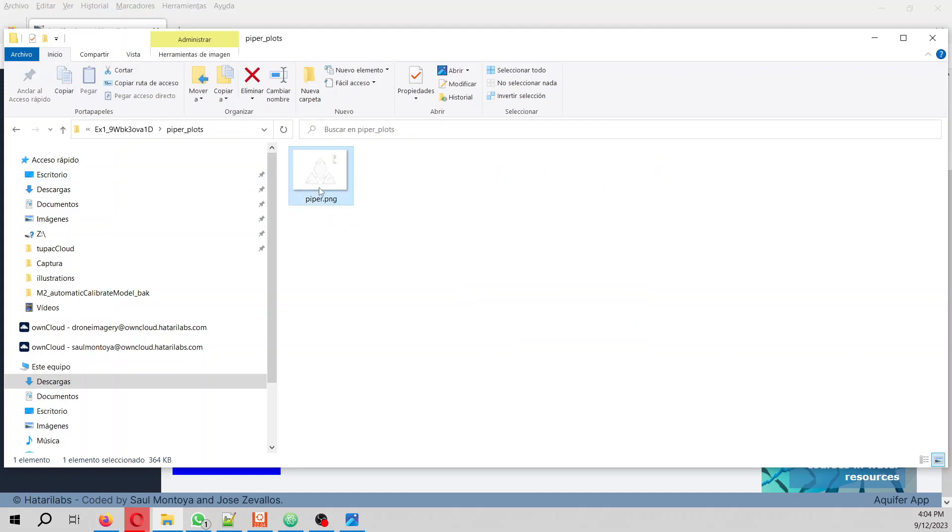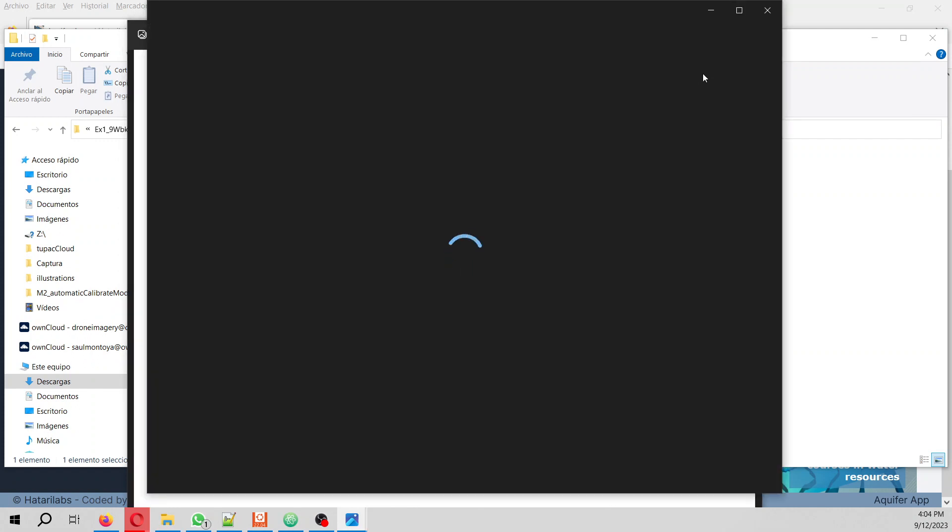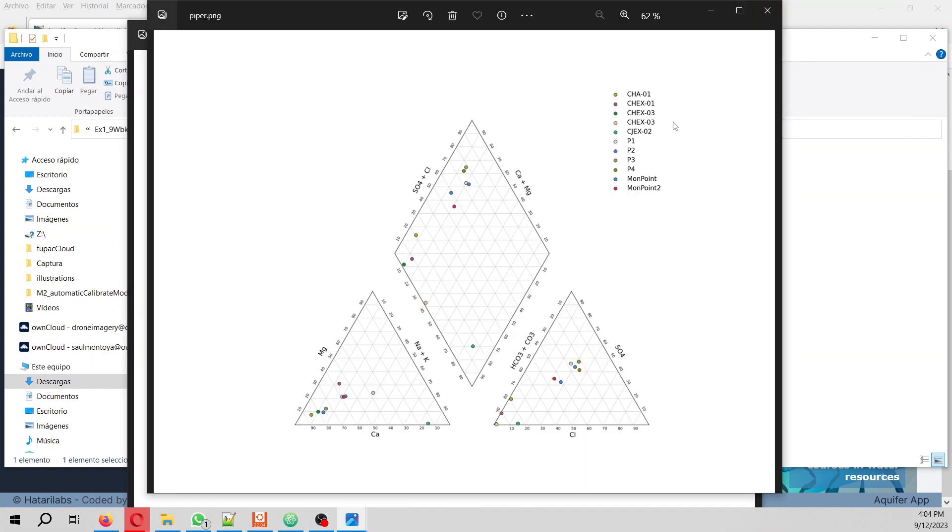Right now it creates the Piper as a PNG, but later on it will create it as a PDF. In that PDF you can do vector editing - I mean you can in software like Inkscape change it, frame it, put the labels in other places, or whatever thing you might be interested in editing on this Piper plot as a vector in Inkscape.